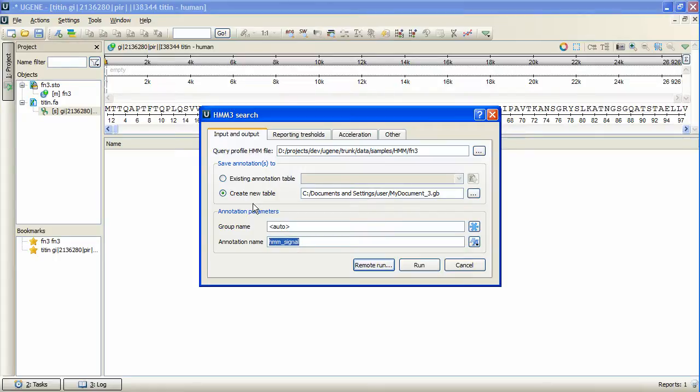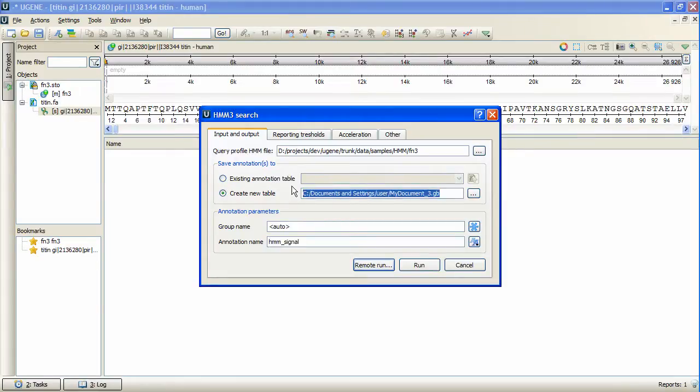These signals are represented by annotations and will be stored at the specified annotations table, for instance, a new GenBank file. Let's look through the available options.